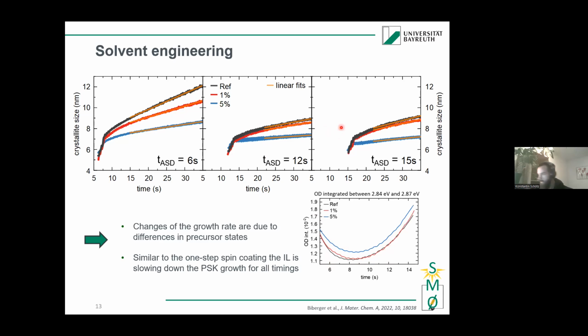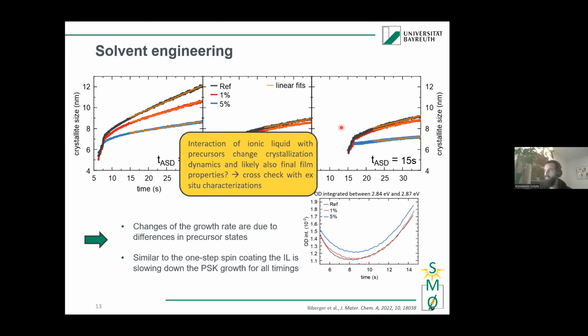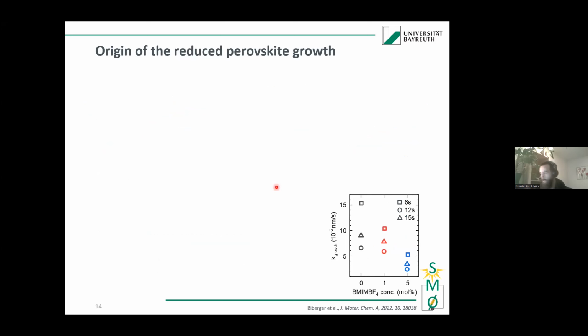So this suggests that the interaction of the ionic liquid with precursor states in the solution, even before the film forms, is likely to change the crystallization dynamics and also the final film properties. Now, to verify this, let's do some cross-check with ex situ characterization.